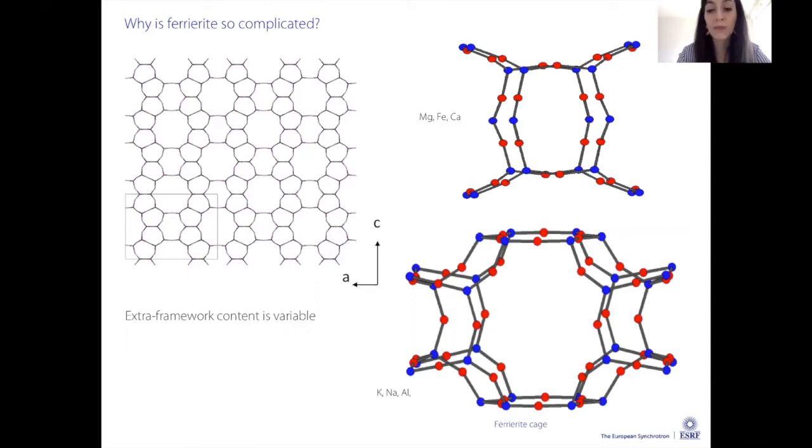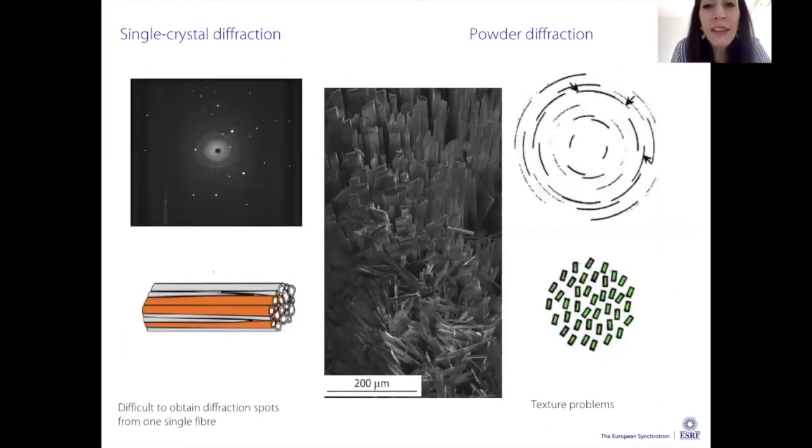Studying fibers is not so easy because if you want to approach them from a single crystal diffraction point of view and your beam is not so small, this pattern you see here is what you basically get. This is a real image I took using a beam size that wasn't even so big - it was a couple of microns. You can see there are some spots coming from single crystals but you can also see rings, meaning these fibers normally bundle together and it's very difficult to get only the signal from one clear and clean fiber.